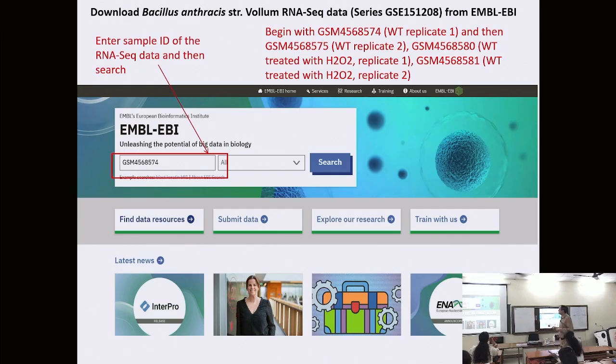So what you will do is input these accession numbers into this box. So 2 accession numbers are for the control wild type of this bacterial strain, and the other 2, so do not do more than 2, because this is only for learning. Once you have learned, you can then do for as many replicates as you want. So I am considering only 2 replicates. He did for 3. So I told him that it is possible that the pipeline will accept 2 replicates.